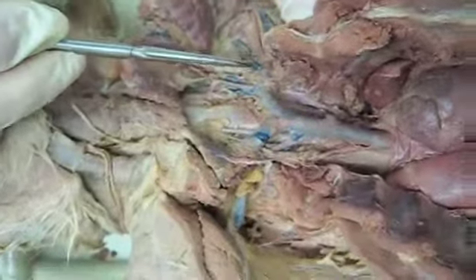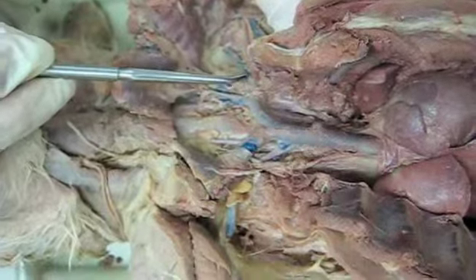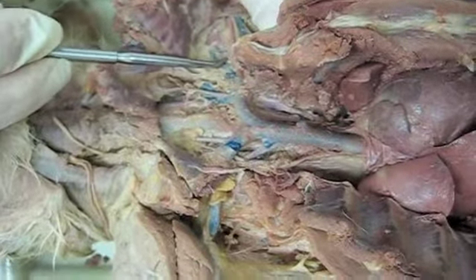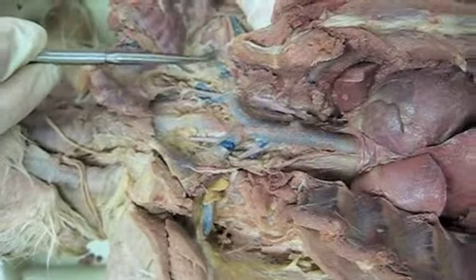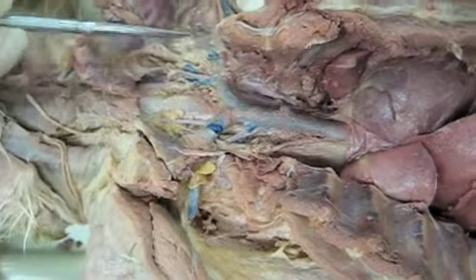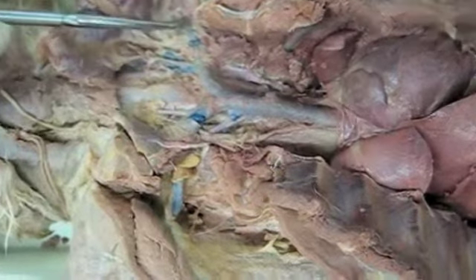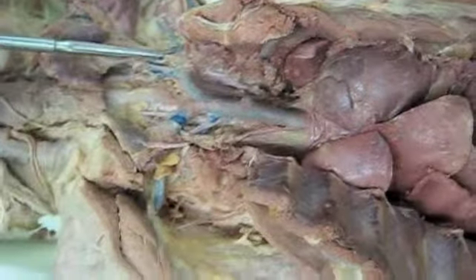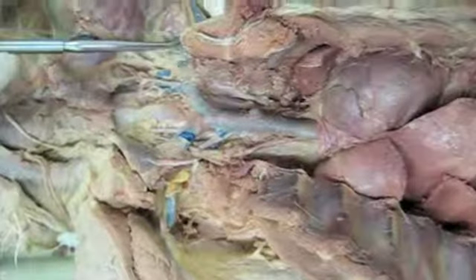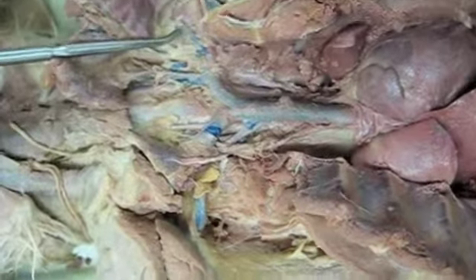Now, we were saying that this is the subscapular vein that comes off way up here off the subclavian. The subscapular artery comes off at a little bit deeper level. So that artery there that you can see coming off the axillary and going right down deep there is going to be your subscapular artery. Obviously the subscapular vein comes off way up here and the subscapular artery comes off down here, but you can see that they parallel one another, so the name is going to be the same.